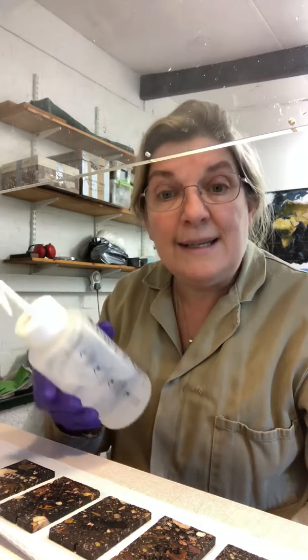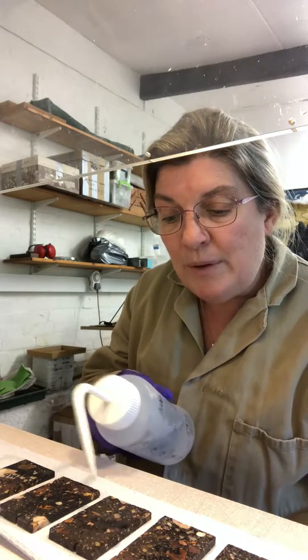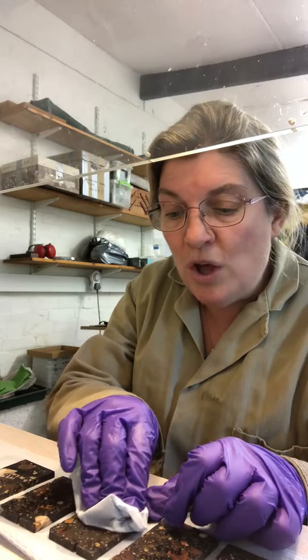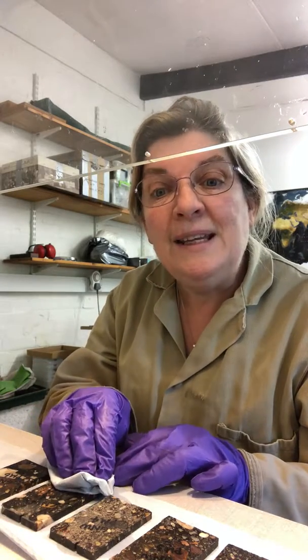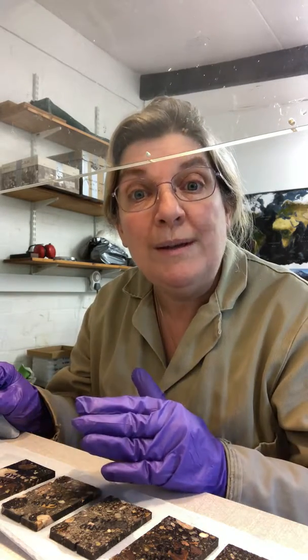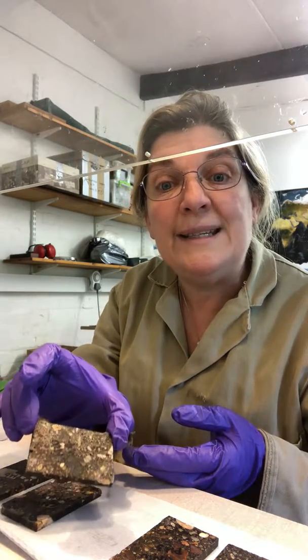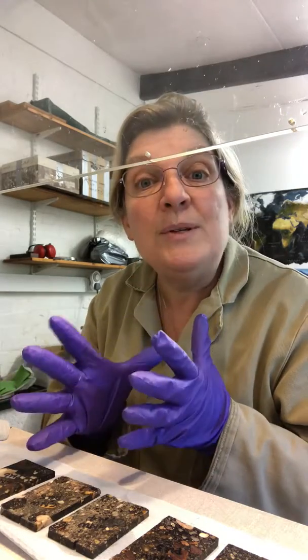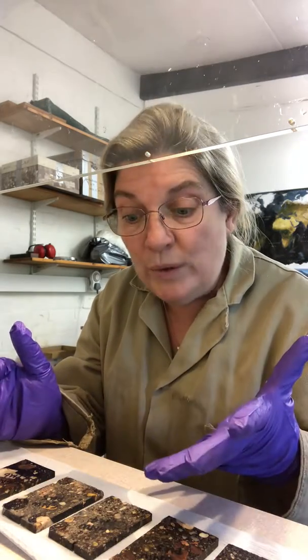Right, so our rule is I'll do it on a couple samples where you can see it in camera. Flood the sample with acetone and don't rub furiously. Pull from the top to the bottom, top to the bottom, and you can see I always pull from the top to the bottom and then blow across the surface to dry out the acetone, and it did pull a great deal of oil off, which makes me believe these samples are impregnated pretty good. They're not acting like a sponge for the oil.